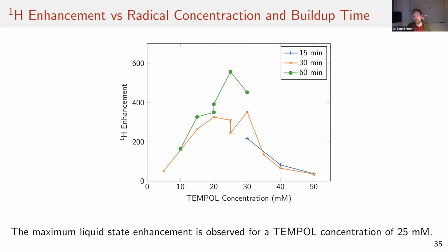Now, this machine has actually only been working for 2 months or so. It was in December that this thing started to work properly. Then, of course, you can progress at a much faster rate, and the sample preparation and data analysis become time-limiting steps. But you also need to process the findings in your head to then take the next step, so it's not infinitely fast. But all the other data, from the autoloader, has been recorded within 2 months. So there's good progress.